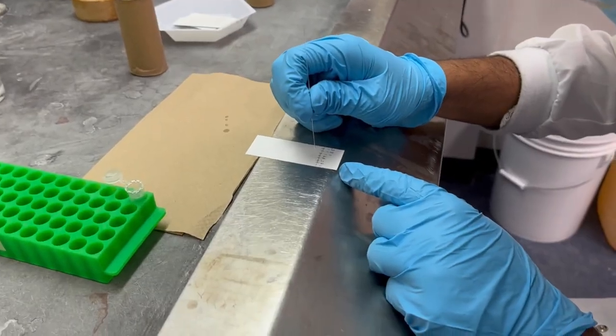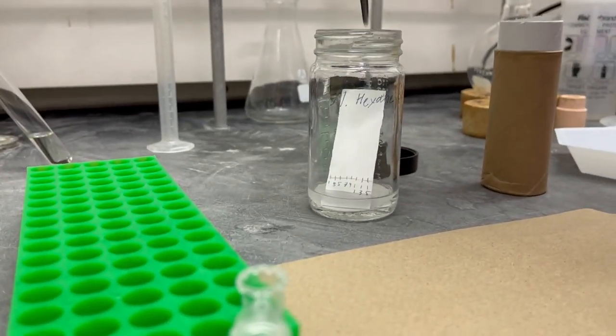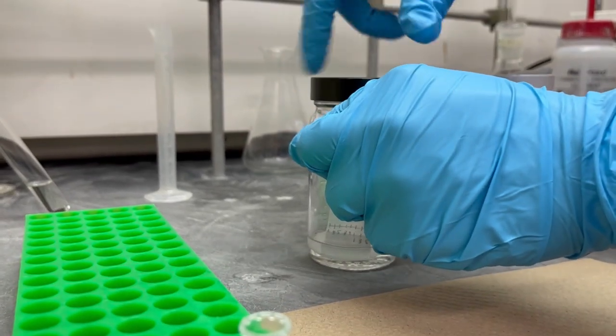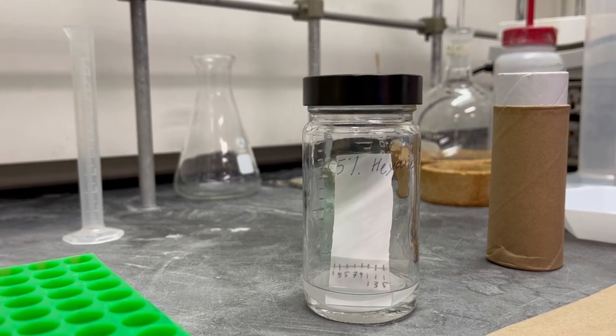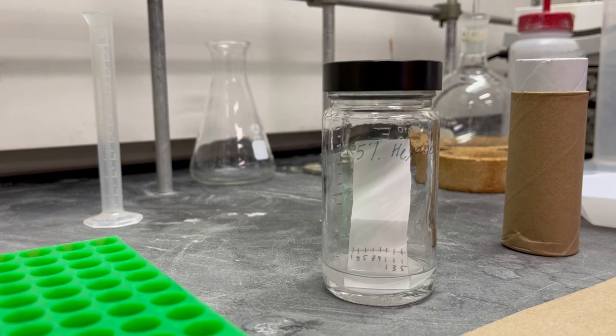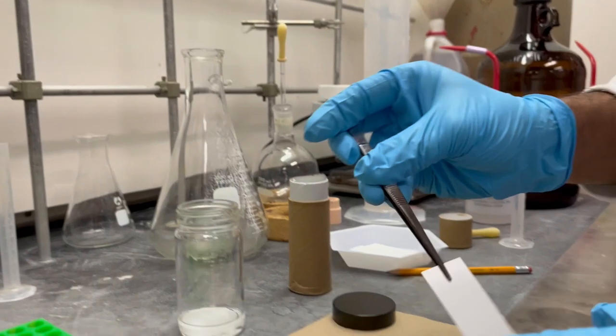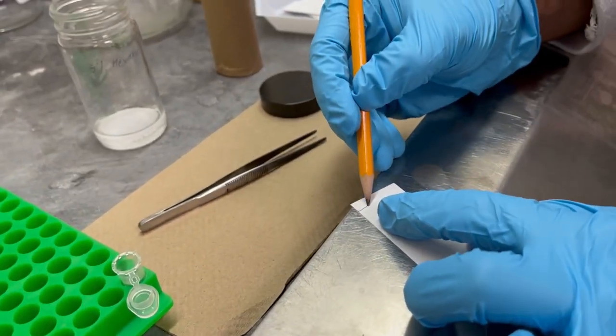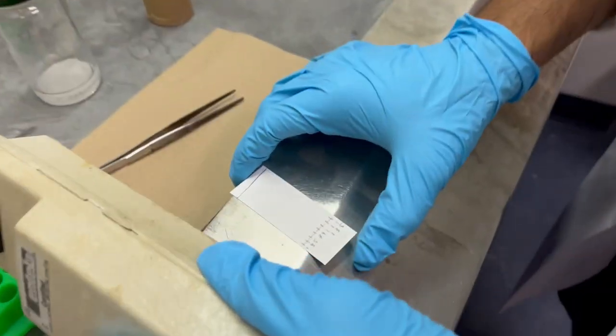Once all the spots are made, using tweezers, the TLC plate is carefully yet quickly placed in the chamber and closed. The solvent then migrates up the plate via capillary action. The compounds should also migrate depending on factors such as relative polarity. The plate is taken out and the solvent front is marked using a pencil before a final analysis.